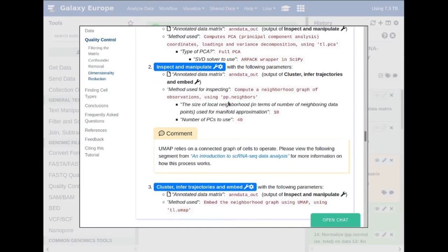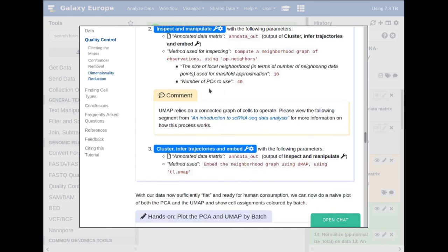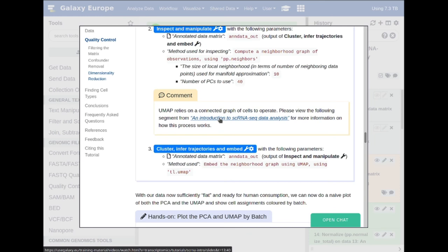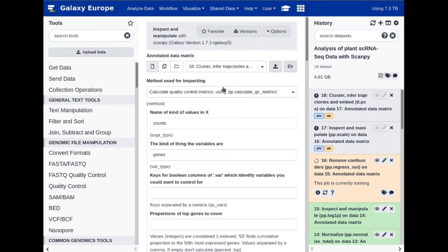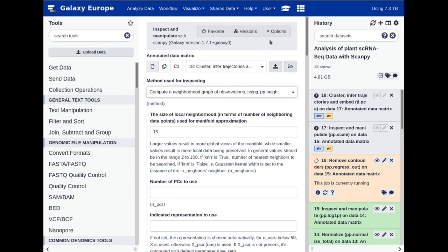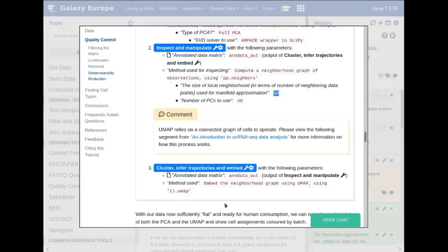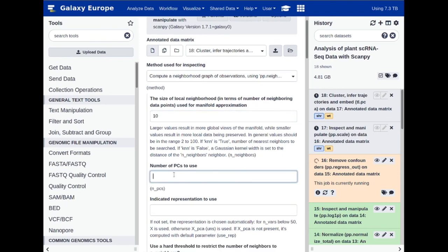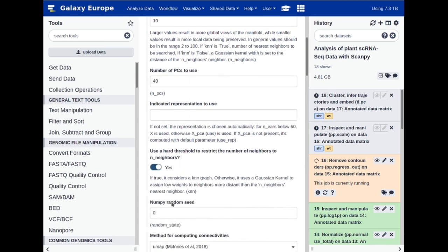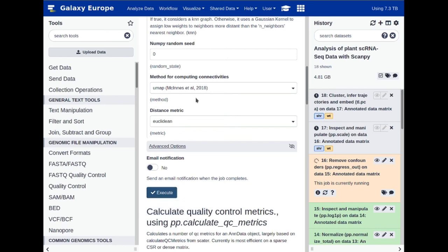Then we wish to generate a neighborhood graph of cells so we can perform clustering on them later. For those not familiar with a neighborhood graph, please look at the introduction video at time point 13:40. For now, go to 'Compute neighborhood': 'PP Neighbors', set the size of the local neighborhood to 10, and use only 40 principal components — we computed 50 but only need 40. We're using the UMAP method of connectivity. Execute.